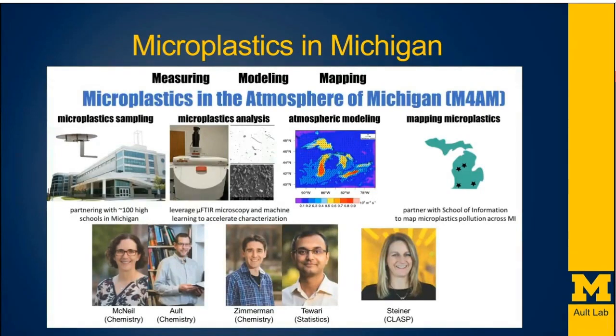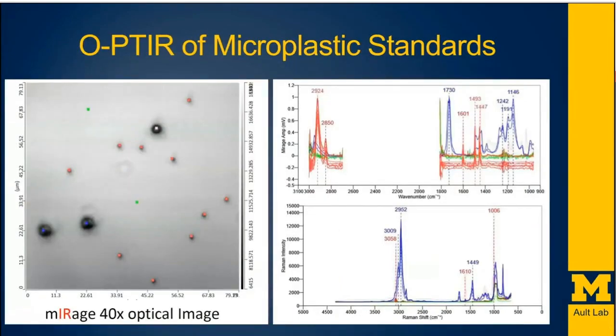And so when we turned to photothermal and said, hey, we're really interested in this, is this something you think your instrument can handle? We got a sample together the same way we prepared them when we sent them to the couple of other folks. And we ended up getting some data back that was really exciting. Here you can see we put 3 different types of plastic particles on this silicon wafer.